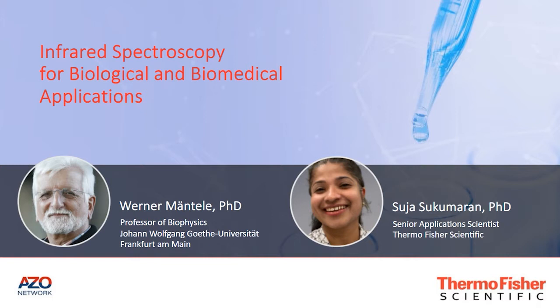Our first speaker today is Professor Dr. Werner Mäntele, Professor of Biophysics at Goethe University. His presentation today will introduce the fundamental aspects of protein structure-function correlation and protein analysis by Fourier transform infrared spectroscopy. Our second speaker today is Dr. Suja Sukumaran, Senior Application Scientist at Thermo Fisher Scientific. She will perform demonstrations using an FTIR spectrometer and microscope and present examples of protein analysis.